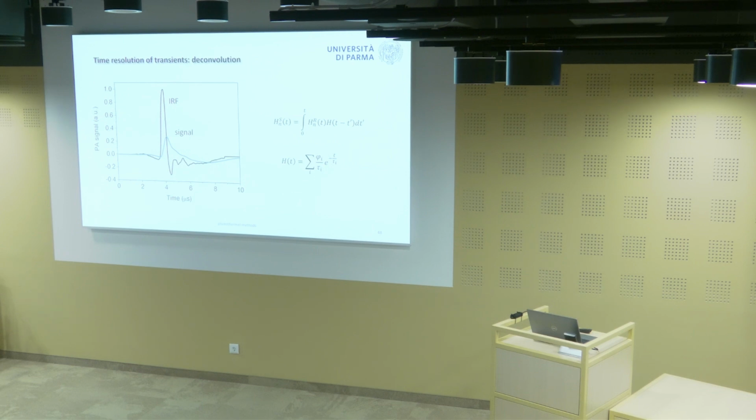and the fact that the heat released is multi-exponential has as a consequence the fact that the signal is distorted in comparison to the instrument transfer function. The black signal is like the pulse in the fluorescence emission, except that since this system is resonant, you have the ringing.